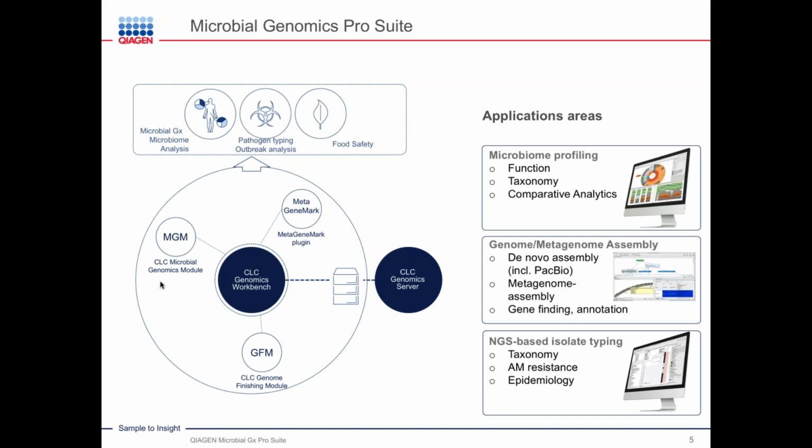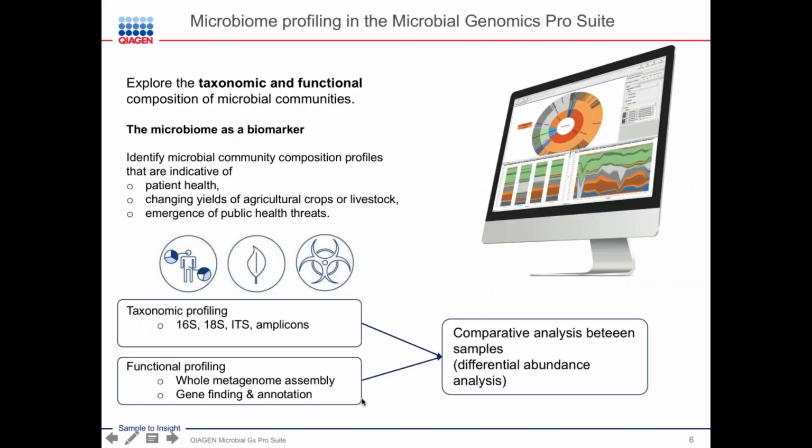Also included are tools for genome as well as metagenome assembly, and tools we're not going to cover today for the typing of isolate genomes.